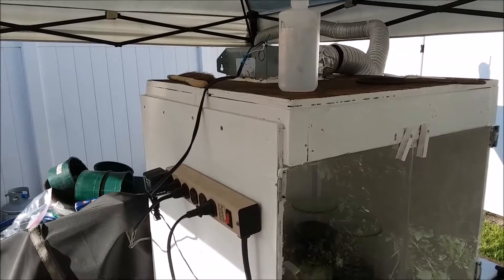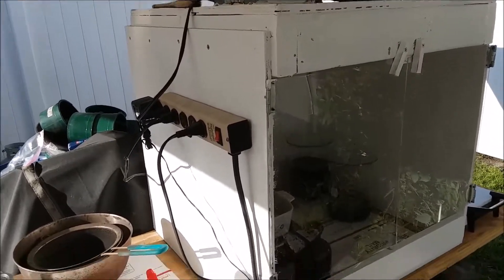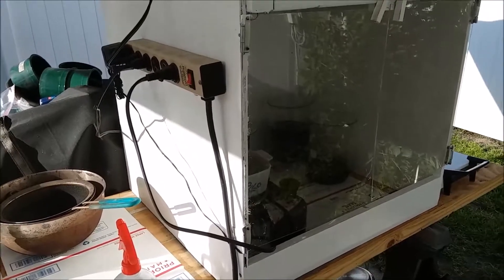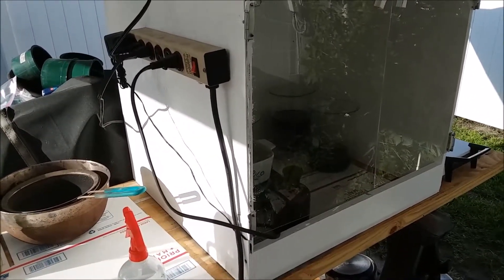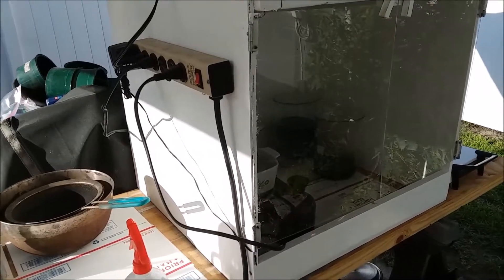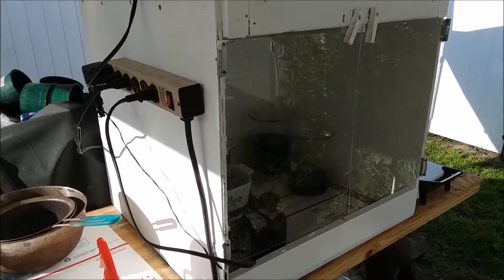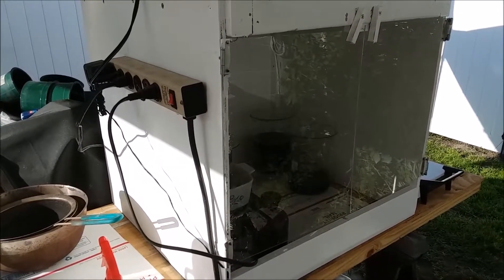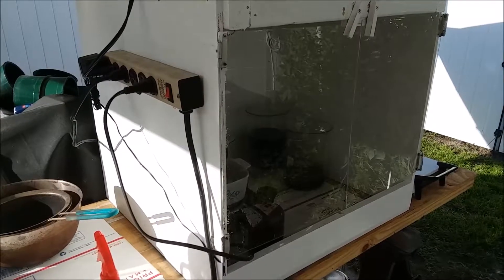The most logical place for the fan is on the back of the box. When I get a chance, I'm going to relocate the fan to the back, and hopefully that will eliminate the condensation drips going into the box. That should solve one of its big problems.